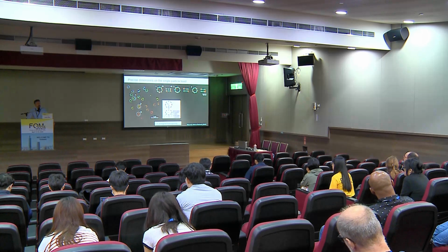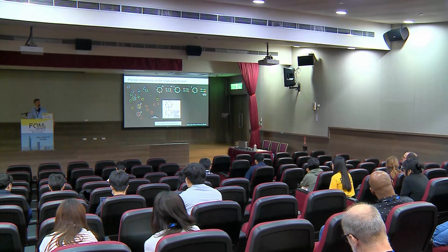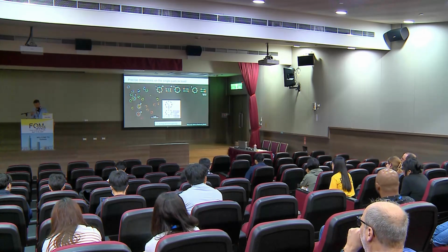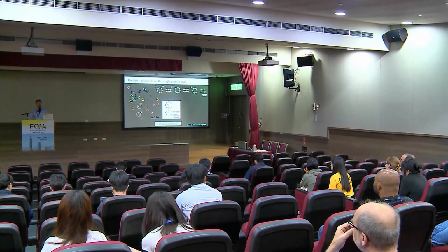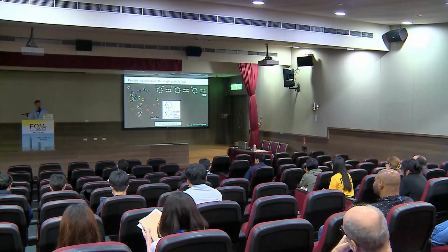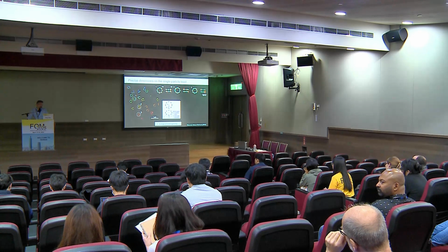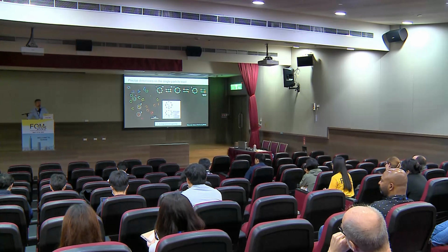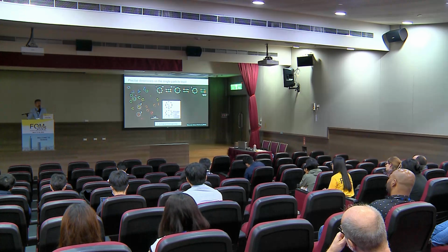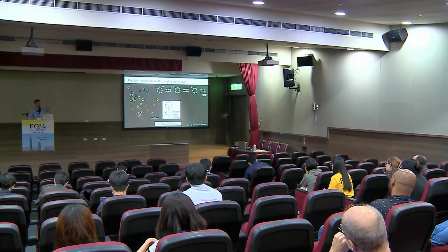I would like to know your opinion on the limitation of MINFLUX tracking, especially when it comes to fast diffusion. In general, I think it works nicely. You get longer track length, but if it's too fast, as the simulation showed, and as people know in the field, on one hand you get very short tracks because you lose the fluorophore, but even before this happens, you get the bias that you can easily track when it happens to be randomly slower.